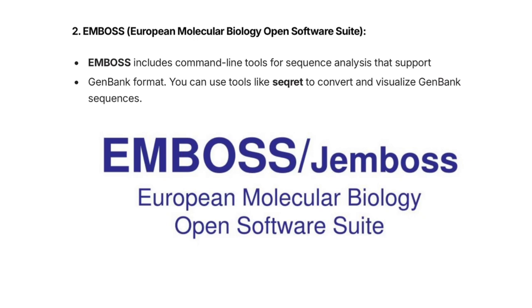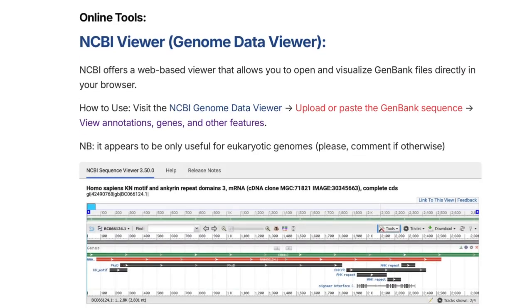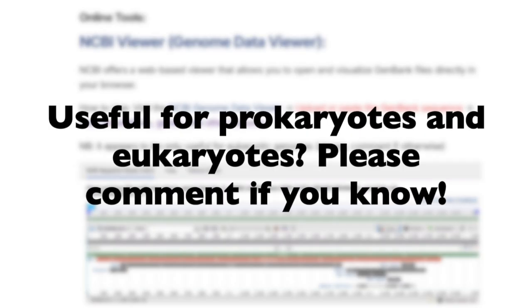Another command-line tool for sequence analysis is EMBOSS — the European Molecular Biology Open Software Suite. It includes command-line tools and you can use a tool like Seqret within it to convert and visualize your GenBank sequences. The NCBI also has a Genome Data Viewer — a web-based viewer that lets you open and visualize GenBank files directly in your browser. Go to the NCBI Genome Data Viewer, upload or paste the GenBank sequences, and view annotations, genes, and other features. At the time of making this video it appeared to be useful only for eukaryotic genomes, so please let me know in the comments if it's also available for prokaryotes.